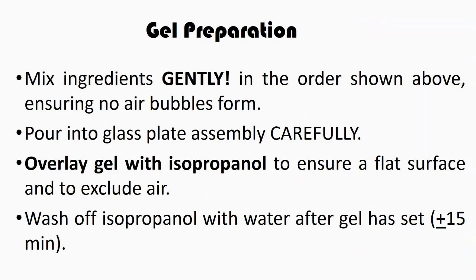For gel preparation, mix ingredients gently to ensure no air bubbles form, then pour the gel solution into the glass plate assembly carefully. After that, overlay the gel with isopropanol to ensure a flat surface and exclude air. Finally, wash off the isopropanol with water and allow the gel to set for approximately 15 minutes.